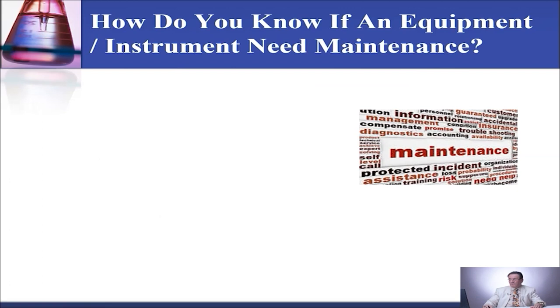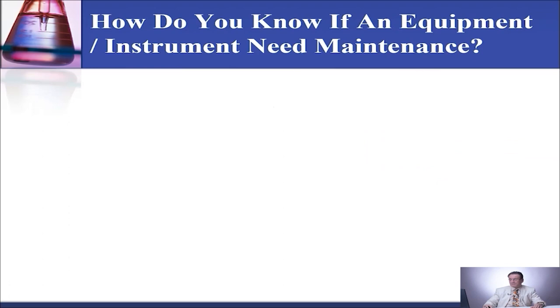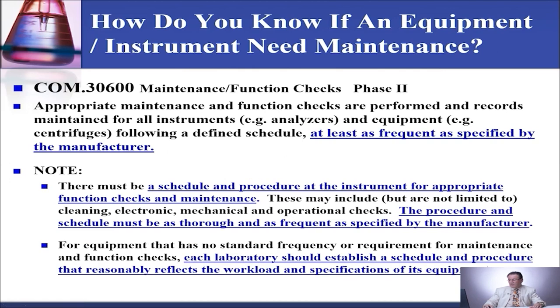How do you know if an equipment or instrument needs maintenance? You need to follow the manufacturer recommendation. CAB in OAL COM 30600, the maintenance function check standard, says that you need to do maintenance on your equipment and instruments at least as frequent as specified by the manufacturer. You need to schedule your maintenance, do it, and record it. Each laboratory should establish a schedule and procedure that reasonably reflects the workload and specifications of that equipment. If the manufacturer does not specify what kind of maintenance needs to be done, you should establish a schedule and procedure for that.